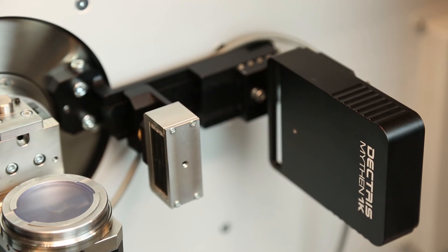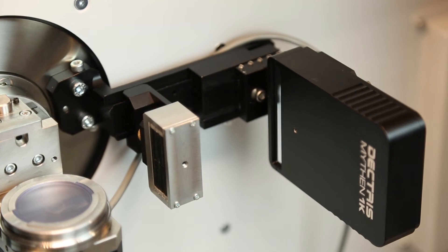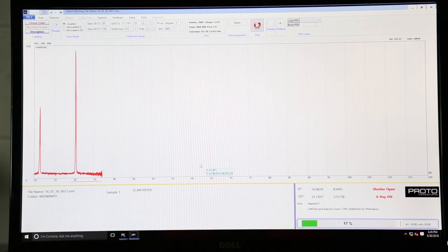The system is equipped with a silicon strip detector that utilizes hybrid photon counting technology, which allows for superior direct detection of x-rays and high speed data collection. The achievable full width half max peak resolution of the instrument is less than 0.05 degrees two theta, and it has an angular accuracy of less than 0.02 degrees two theta over the full angular range.